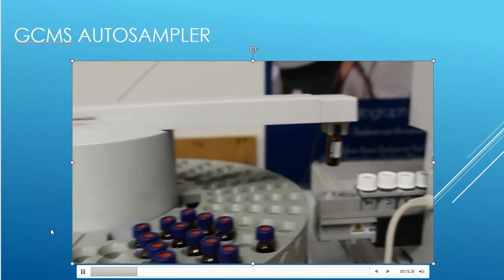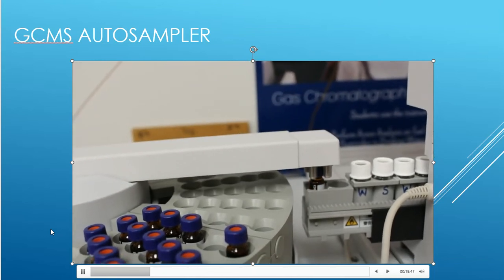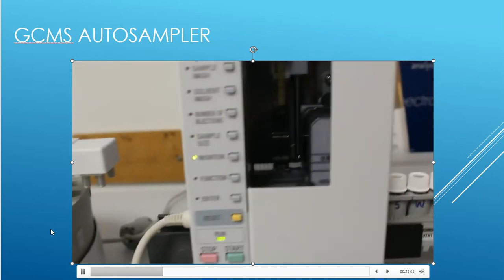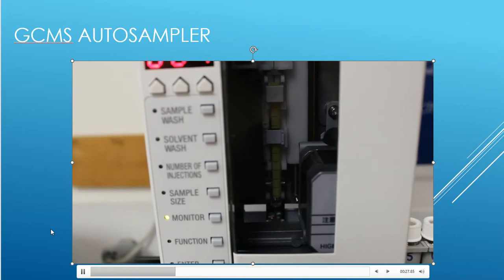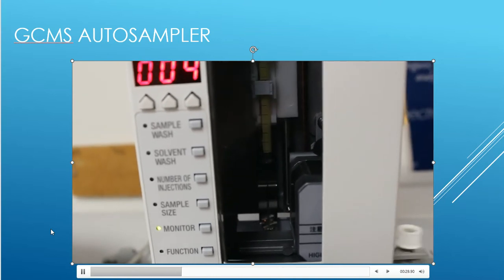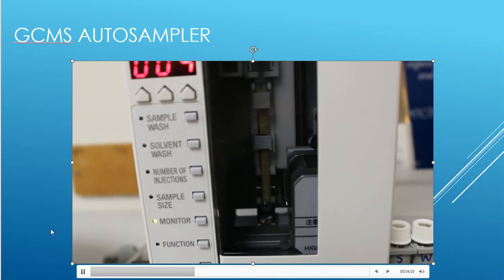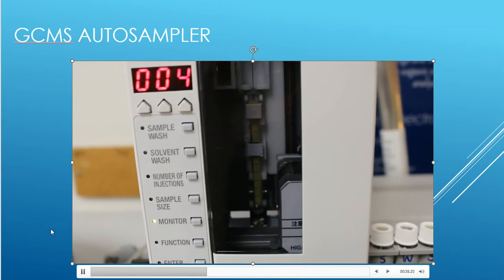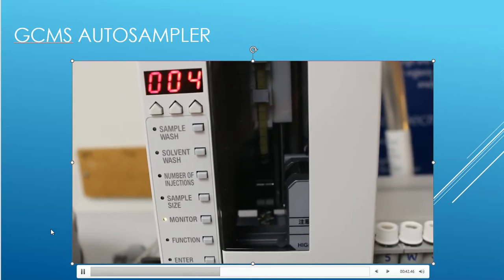All right, folks, so it's injecting a sample right now into the machine. So you see the grab arm that's lowering the sample down into the tray. Then that sample is going to go basically here where the needle's at. And the needle's going to clean itself, get rid of some waste. It kind of pre-rinses in the beginning. And then that injection needle is going to take up a sample portion and it will inject that sample portion down into the instrument.